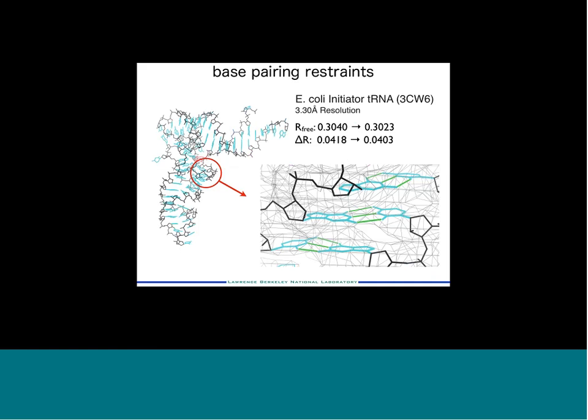And so you can see here is just an example. I've focused in on 3 base pairs in this particular structure, and you can see the density is just a bit of a mess, kind of a sea of density to fit that in. And so if you refine this without restraints, those bases will no longer be in the right plane relationship and may deviate a bit from each other. But by putting these bonds in, they'll move more in a concerted motion during refinement, so you end up with a better model at the end in terms of geometry validation.